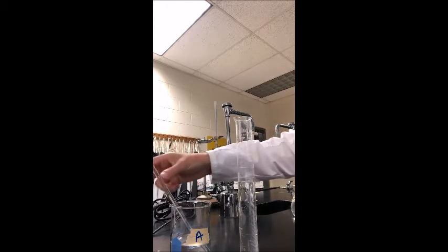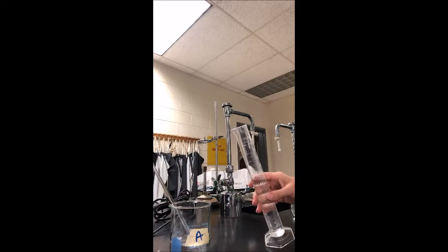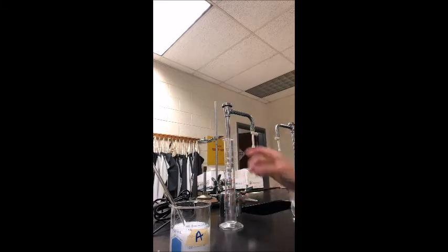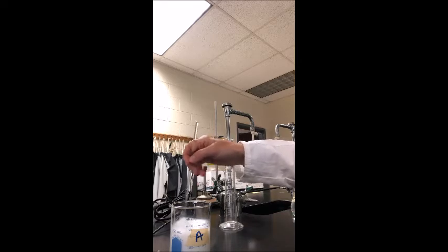Here's my A sample. It's all nice and dissolved in its beaker. So all I have to do now is add this and stir for 30 seconds. And then I'll be setting up my filtration. Oh, look at that. Look at that nice white precipitate coming out. So I stir for about 30 seconds. Make sure everything gets reacted.